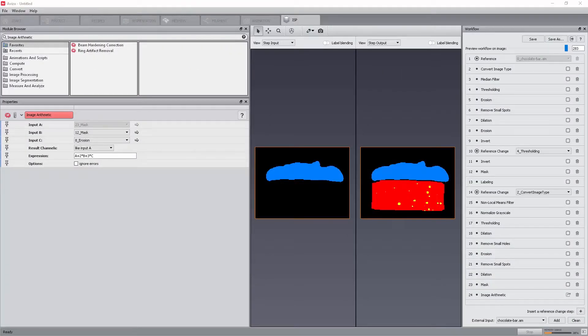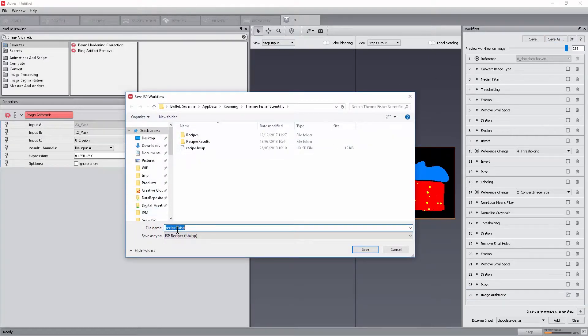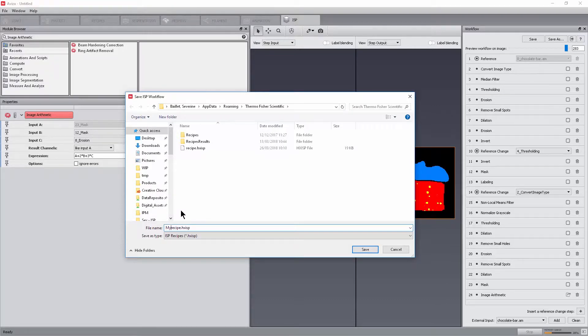From the workflow window, click Save As and then save the workflow on disk. The file extension is .hxisp.